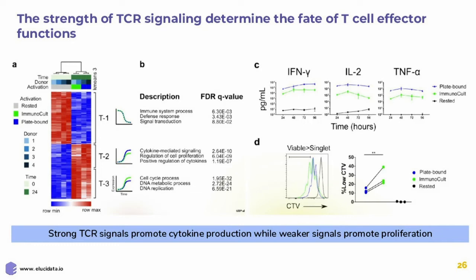In contrast, what we had been doing was stimulating the T cells with anti-CD3 and anti-CD28 antibodies, which have a dramatically different affinity for the TCR than the peptide-MHC complex. And so the question on our mind was, does this mode of activation really impact the effector functions and in turn the metabolism of the T cells? While we were not set up to look at the metabolic changes in T cells in a co-culture model, we decided to use different formats and modes of TCR signaling that we knew had a different impact on effector cell function, and then look at the metabolism that went along with the T cells.